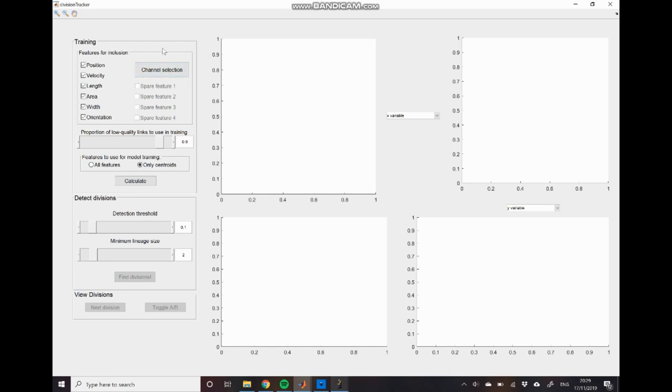However there are three main differences between the division detection module and the tracking module. Firstly we break the assumption that objects remain static in feature space or at least close to static. Instead we assume that there is a large but predictable change in displacement space as we go from the mother to the two daughter cells.